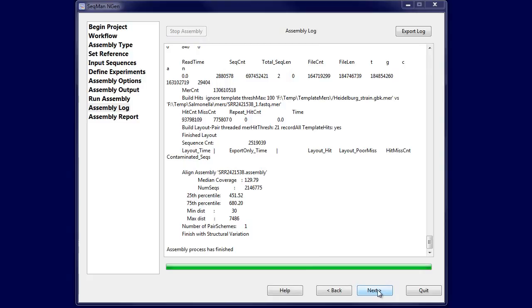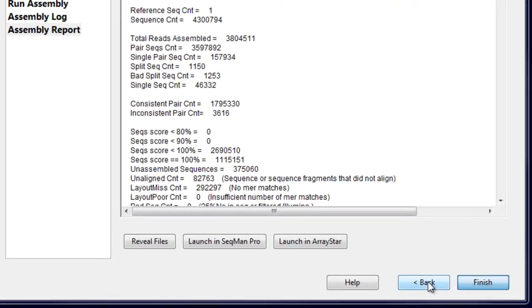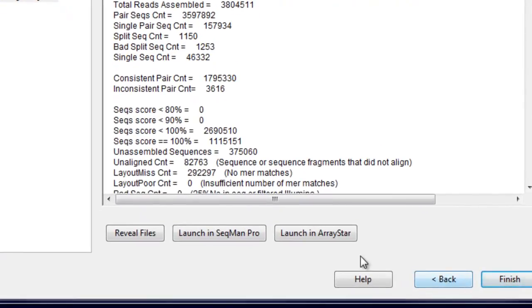Once the assembly is complete, you can open all of the aligned genomes in ArrayStar for SNP analysis.